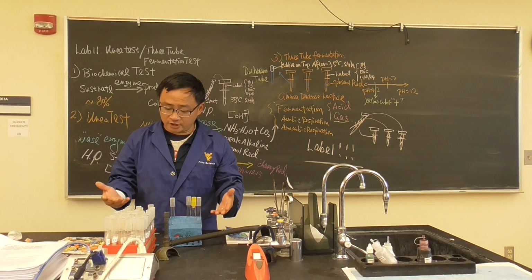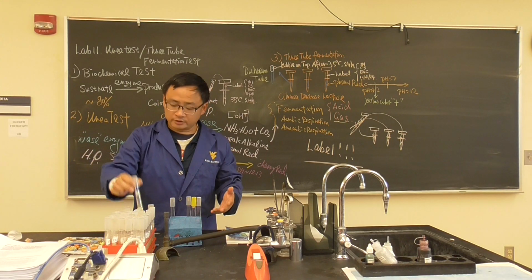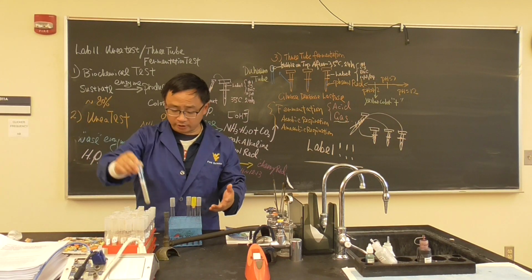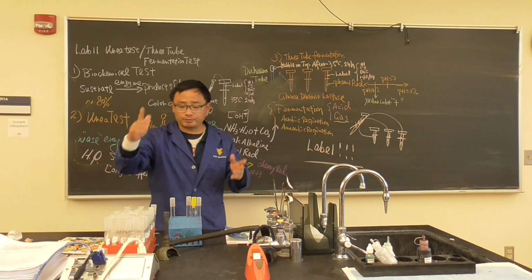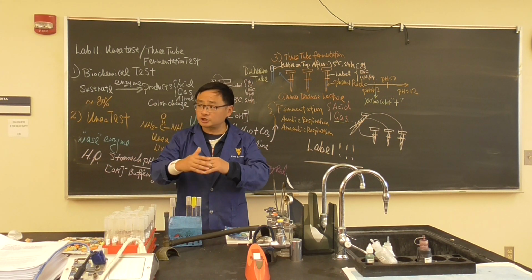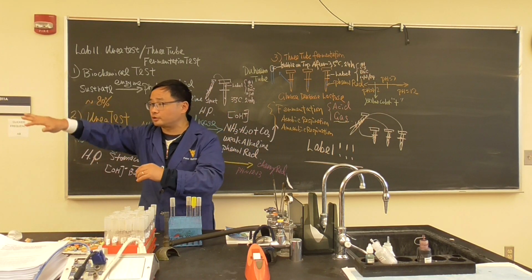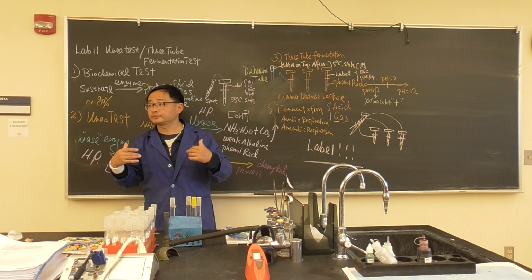We have 3 bacteria: E. coli, lactobacillus, and citrobacter, and we will assign the culture. So I start to assign. You only pick and assign the culture. The results on Thursday, you share with your bench partner and also with a small group of 3 of you. Then you can all see the results. Then we'll talk about that.